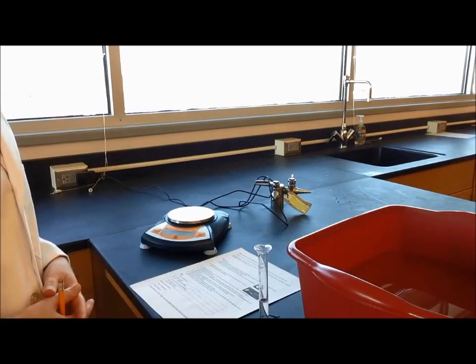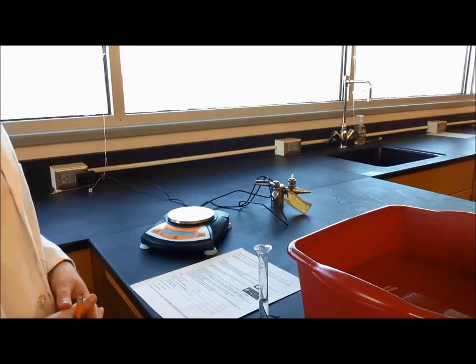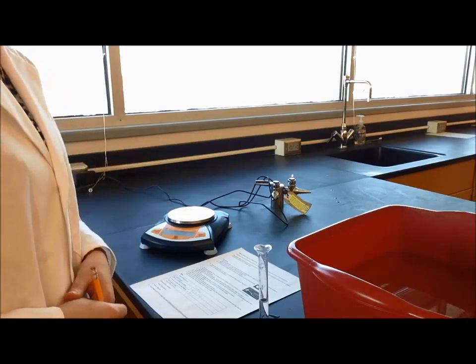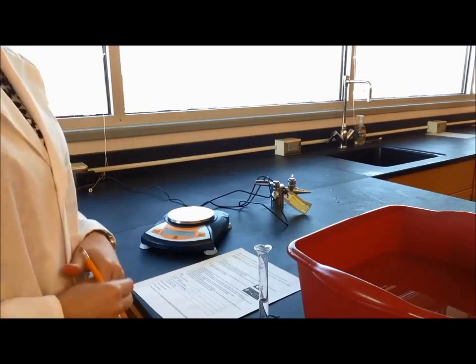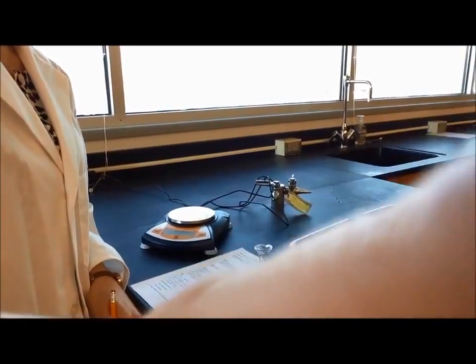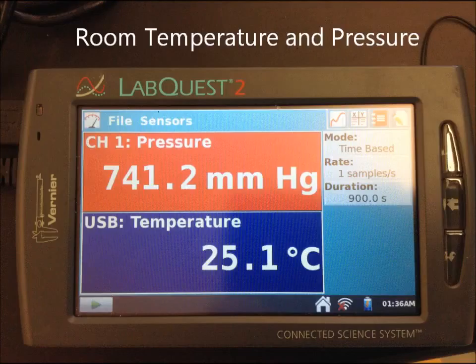The procedure is now complete. The only two additional pieces of data I need are the room temperature, the room pressure, and the vapor pressure of the water. With all that data, we'll be able to calculate the molar volume of our hydrogen gas.